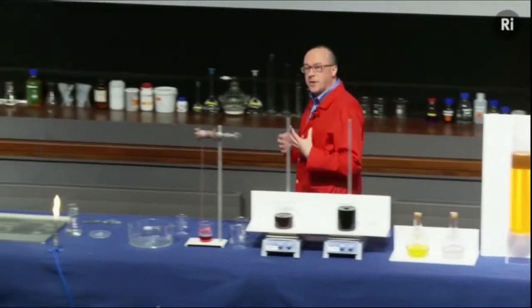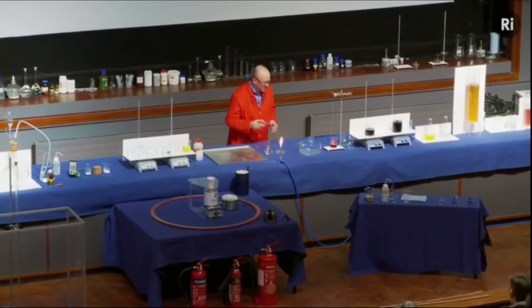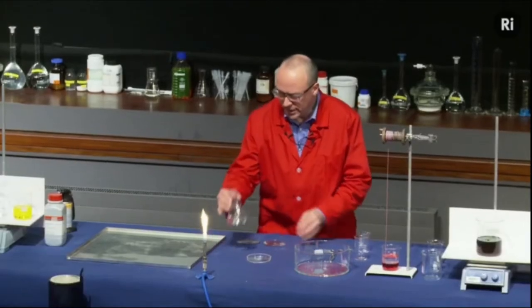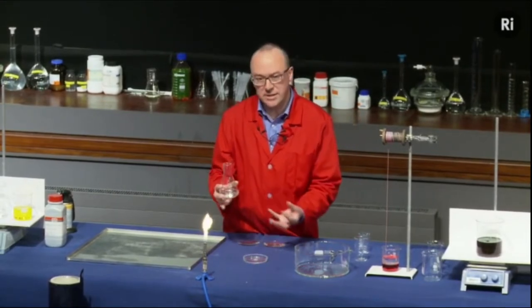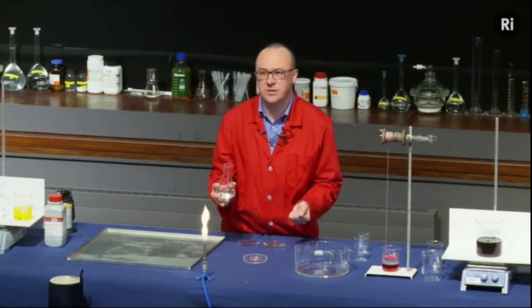Okay, so that's an example of a chemical reaction that produces a change of state. I want to show you another example of a chemical reaction. Again, this is going to go from being a liquid to being a solid. So in this flask, I have a solution of sodium acetate. And this sodium acetate is a liquid, as you can see, but it would very much like to be a solid.